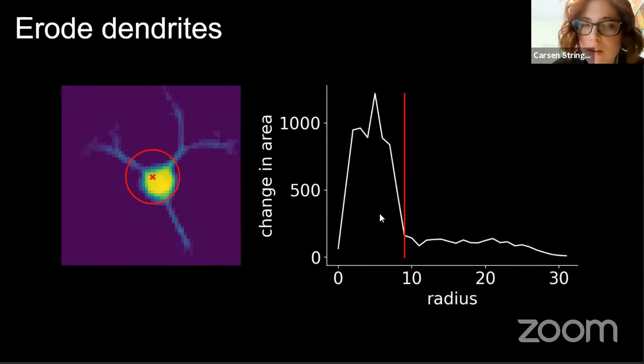Are people using Suite2P with other indicators? Yeah, I have seen people use it with voltage, but I don't think it's super popular yet. But the principles still hold the same way. You want to find pixels that are correlated across time. You could also use Cellpose on some of those recordings, particularly if they have high baselines.